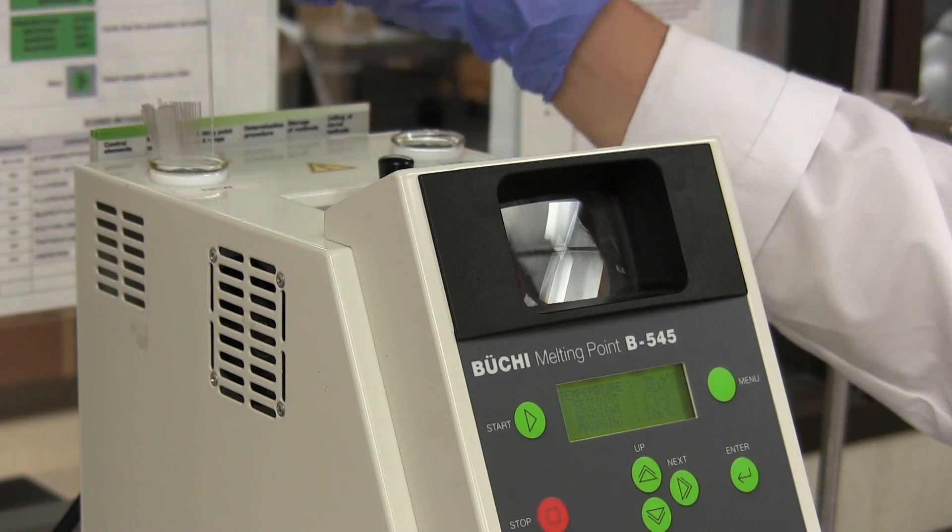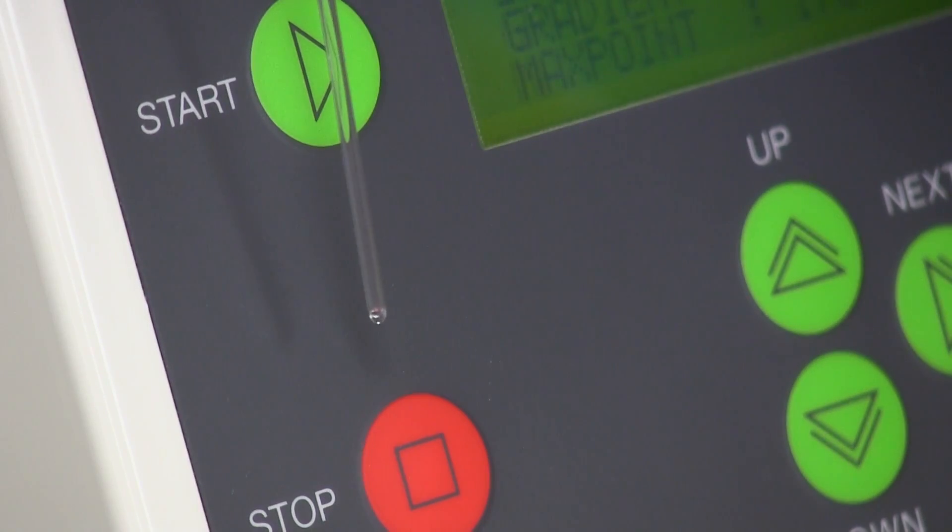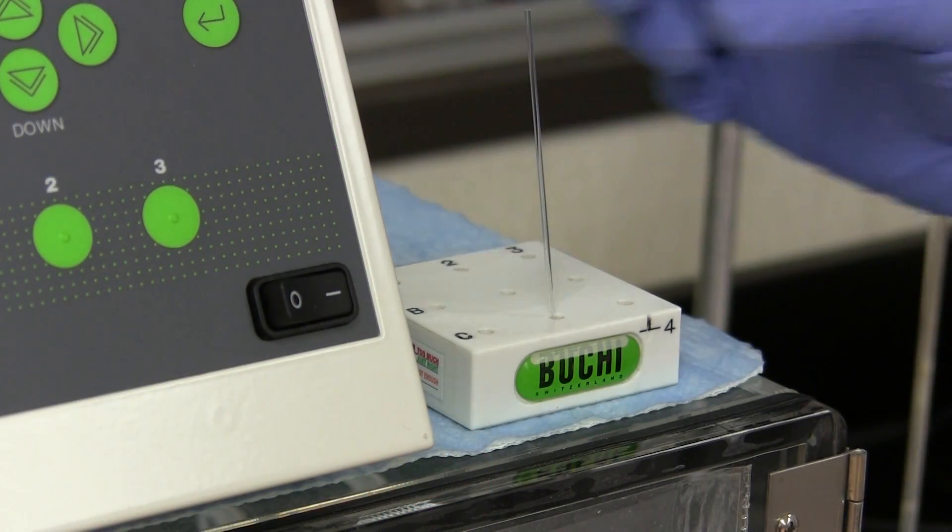Capillary tubes are available at the machine. These capillary tubes are sealed at one end. A rack for holding the tube is nearby the instrument.